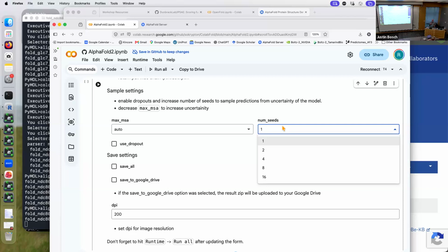But for the real data that you might put in a paper, or the model that you might really start planning experiments on, I would do 50 models or 100 models. So do 8, you'll get 40 models. That's fine. So let's say we would set it to 8.